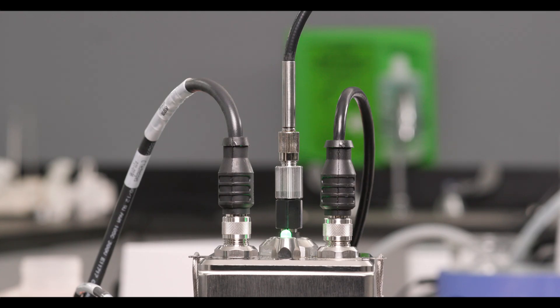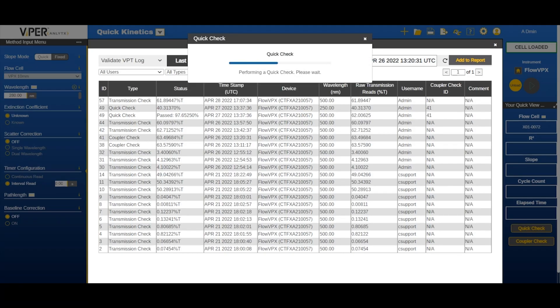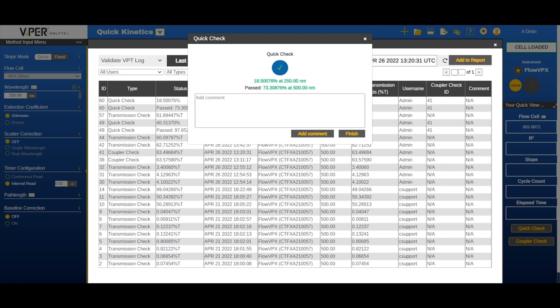The software will quickly begin measuring transmission and will display the results. If the results fail, refer to our troubleshooting video for suggestions on resolving low transmission.